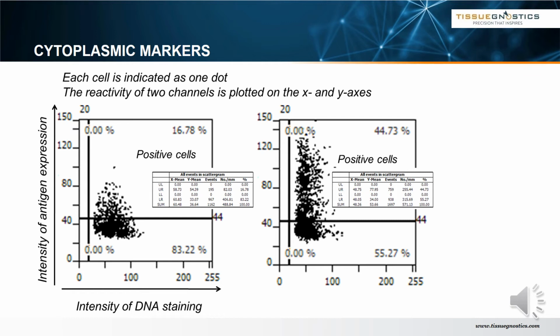But what we also see is that there is a shift towards higher populations. In normal skin, the maximum value is here around 90, but that increases after UV irradiation to 130. So what we visually perceive as more cells positive is reflected in this percentage value, and what we visually perceive as the cells being stronger positive, this is reflected here by the shift towards higher values.